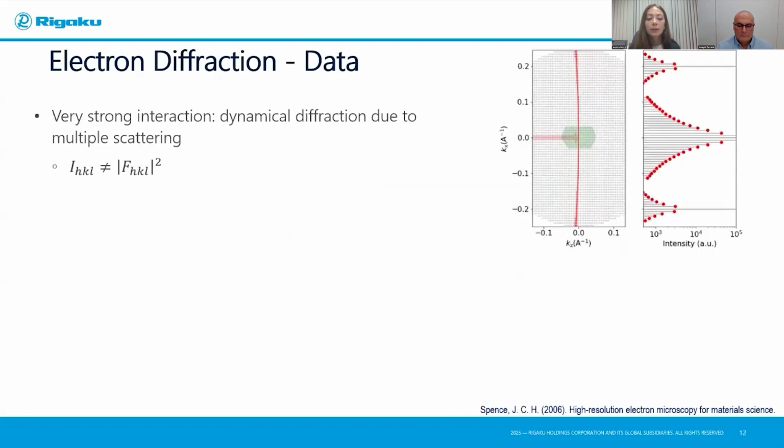And so it might be a bit surprising then, if electron diffraction is so useful, why it's sort of lagged behind in terms of popularity when you compare it to single crystal X-ray diffraction. And the reason for that is this sort of double-edged sword of working with electrons, where this very strong interaction means that electrons are scattering within your small crystals not just once, but oftentimes in pretty complex ways, including multiple scattering events, which we call dynamical diffraction.